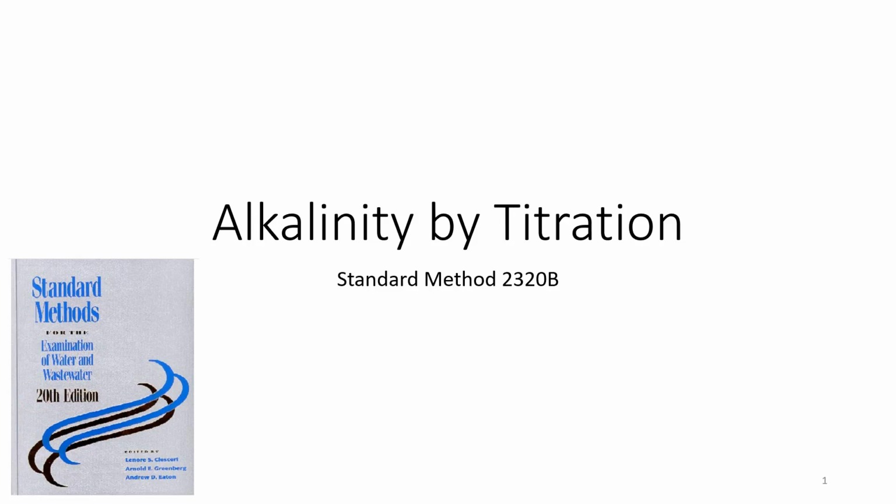Hi everyone. We're going to determine alkalinity in Duck Pond and Boone Creek by titration, and again we're using a standard method that comes from this book.